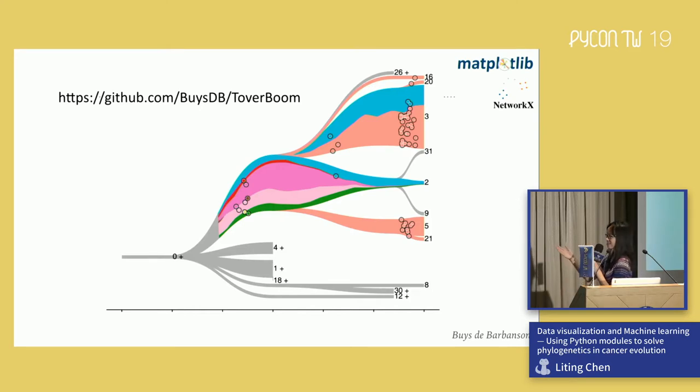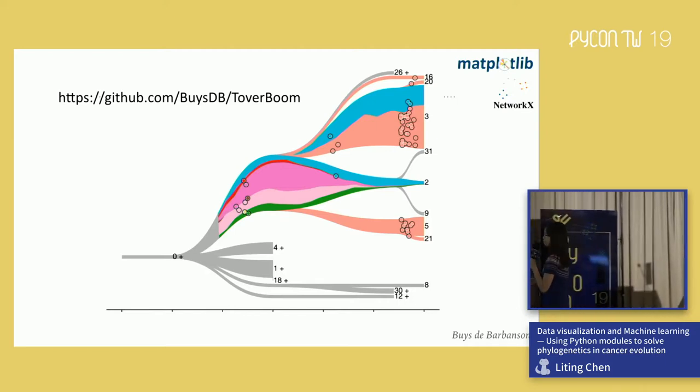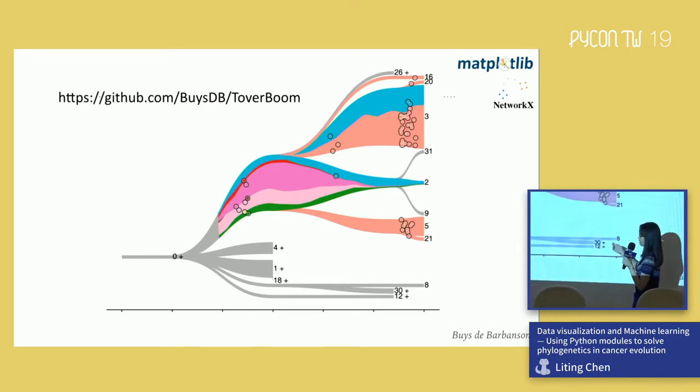So this graph shows multi-layer data information. The first layer is that copy number variation is used to build a tree. And then on top of it, we plot another piece of information we acquire from single cells, that is the cell barcode we introduced at the very beginning of the experiment. That is a viral barcode. So you can know for sure that if two cells contain the same viral barcode, they are from the same clone.